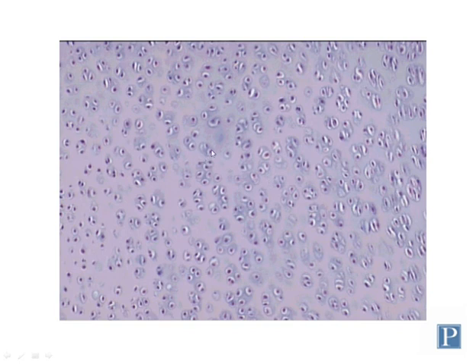You can see chondrocytes within their lacunae, surrounded by territorial and interterritorial matrix. These cells are in reserve, and eventually these cells will begin proliferating and then eventually ossify and convert the matrix around them to a bony matrix. So in the meantime, these are held in reserve, and so this is called the zone of reserve cartilage.